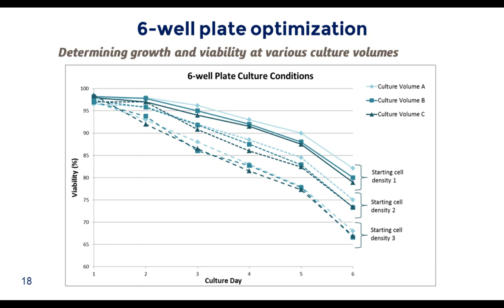Selection of culture volume should also be informed by pipetting method. For example, a starting volume of 1900 microliters would require 3 pipetting trips per well if your pipette tip can only hold 900 microliters. Keeping air gaps, both leading and trailing in mind, a 1025 microliter pipette tip holds less volume than 1025 microliters in practice. An 1800 microliter starting volume requires 1 fewer trip per well and could save many minutes per scale-up process.